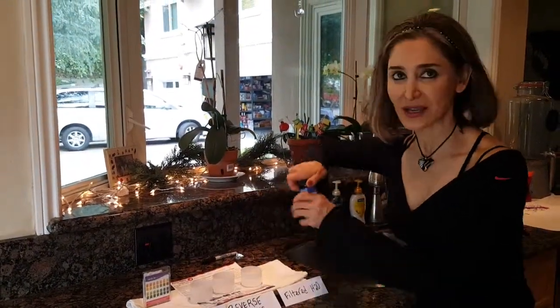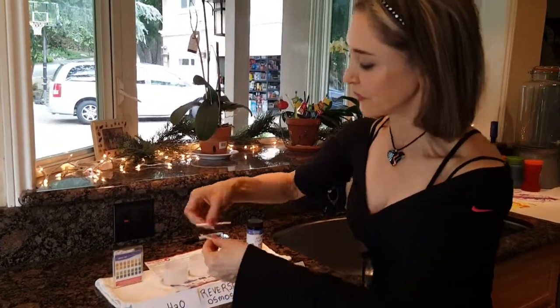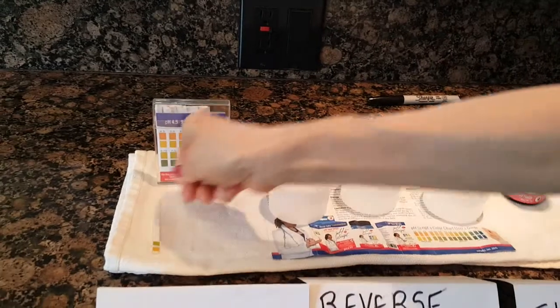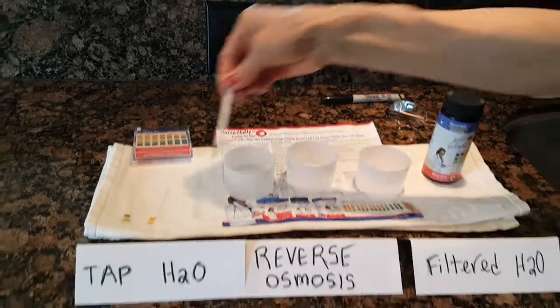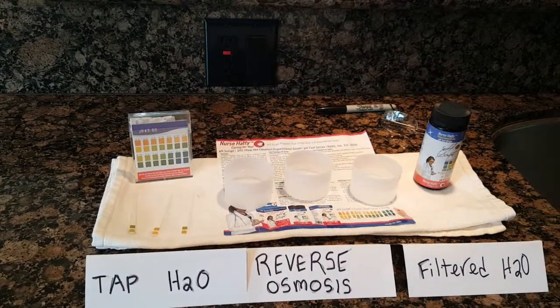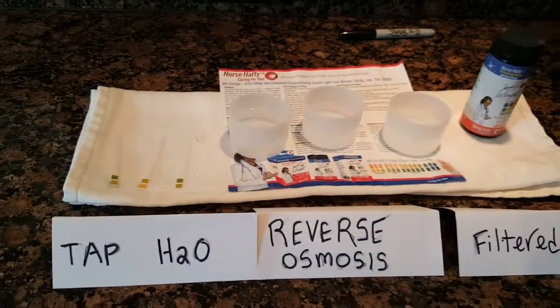Remember, you're going to take your pH strip from the little box. I've already taken them out. We're going to dip them for 15 seconds. So this is the tap water, this is the reverse osmosis, and this is the filtered water. Alright, 15 seconds on the clock. Do you see the colors changing? Okay, we're done.